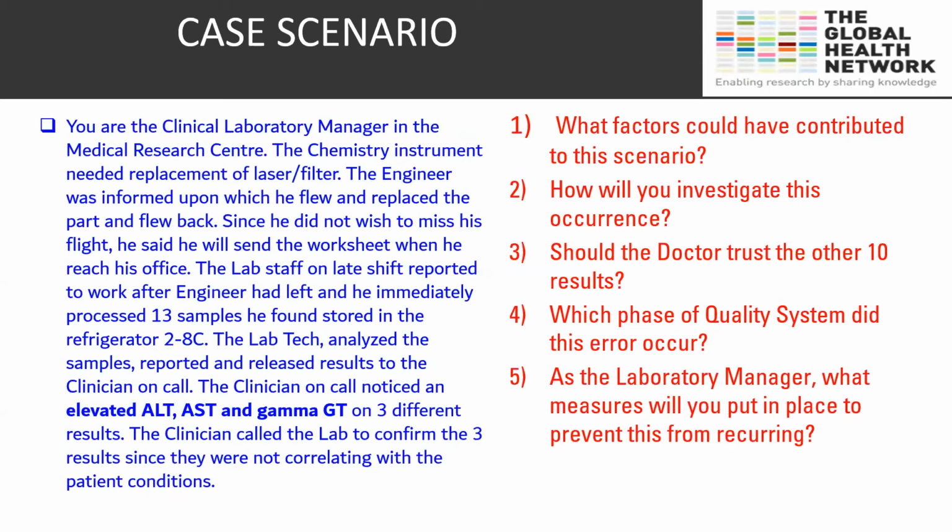So if everyone can type in their responses to question two, how would you investigate this occurrence? If there's any answer that has come in, please just read for us. Yes, so Zamkule Matsebola says, I would use the 5 whys. I'm not sure what that relates to. Ken, I'm sure you're the expert on that. You interpret that. I think the 5 whys is like, what happened? How did it happen? Why, how, when, who. So those are, I think, the 5 whys, which is correct.